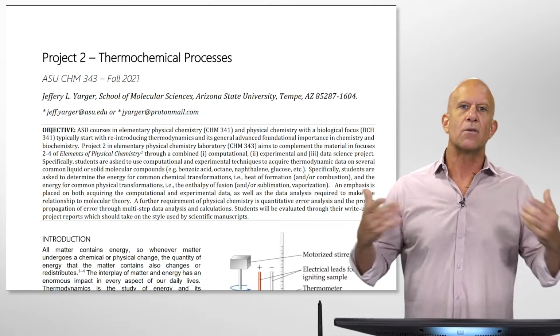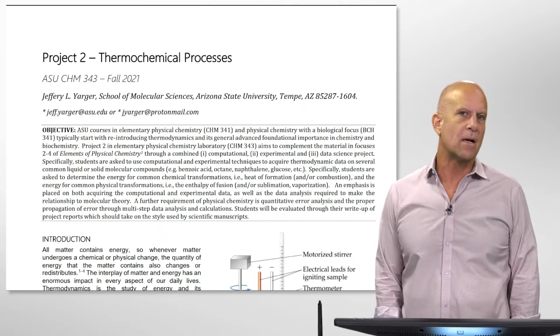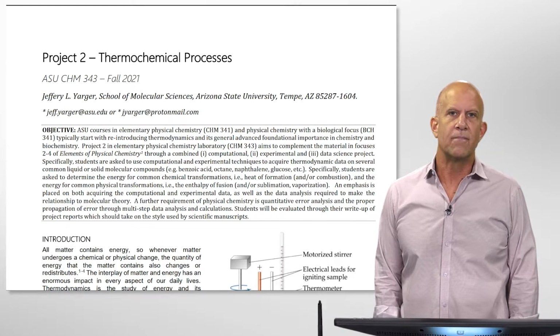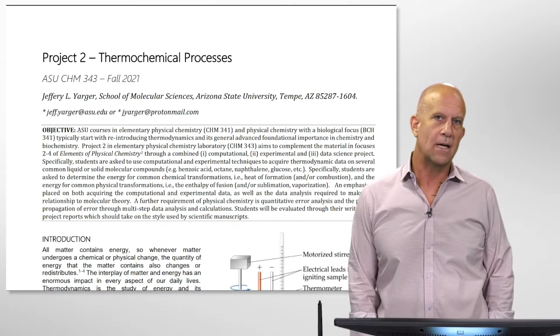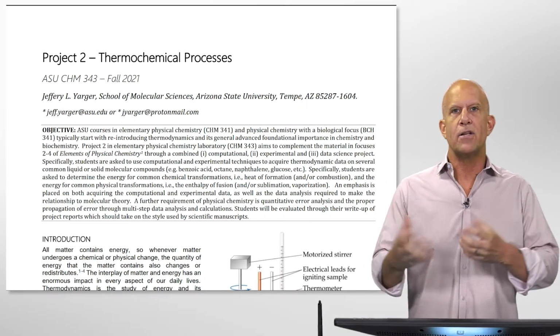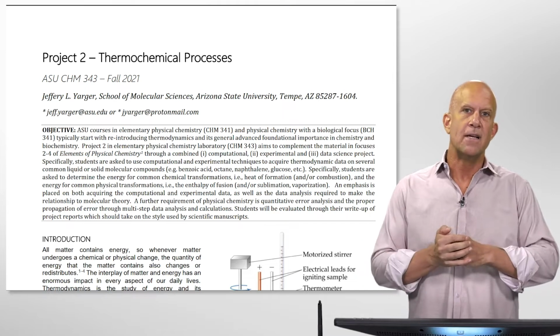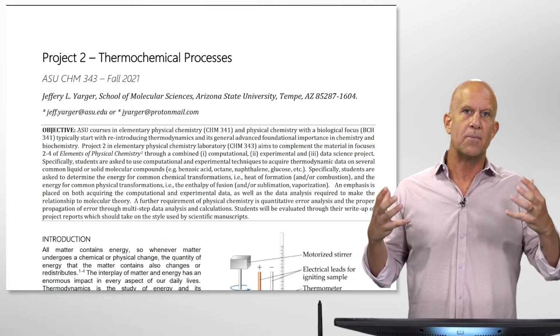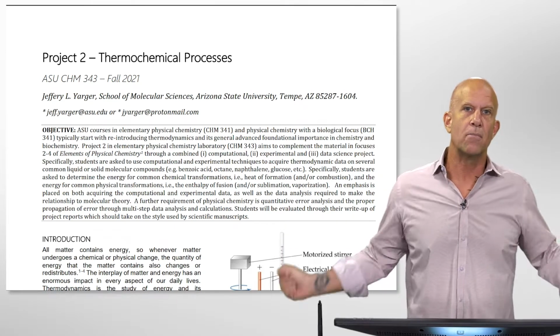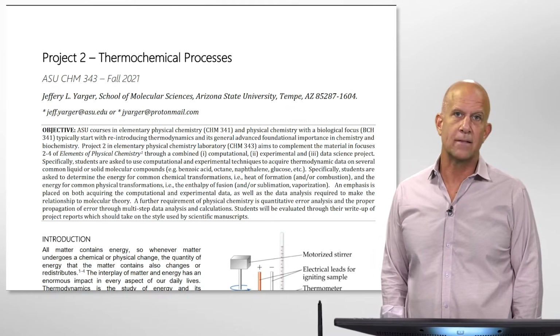And the general concept that we use in physical chemistry can be summarized by calling it PChem Cloud Lab, which is we're doing things where we are trying to use remote access, automation, and to be able to access kind of a modern modality for laboratory experiments.